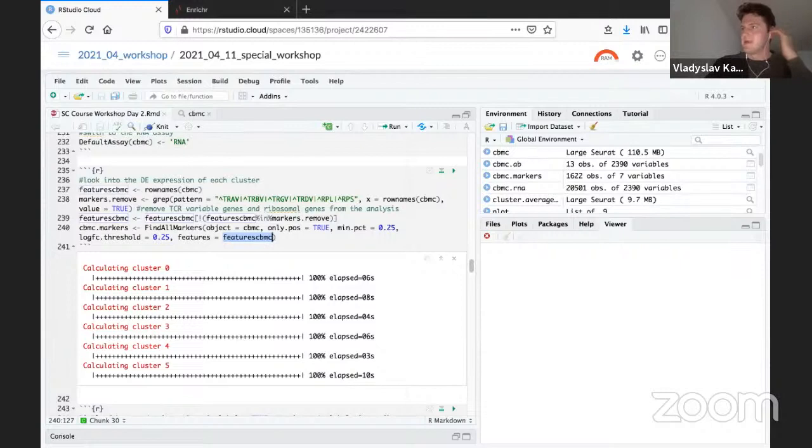So the next question is, it's not my question, but is there anything you can suggest or have seen used? I feel like the gene expression can be altered by the processing sometimes. With the fixing. Okay.